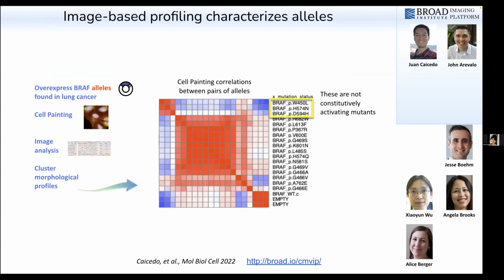And what's really exciting is that it's not a disease-specific assay. You could run it on absolutely every variant uncovered in every sequencing study for every disease to get a handle on the diversity of genetic variants for each disorder.